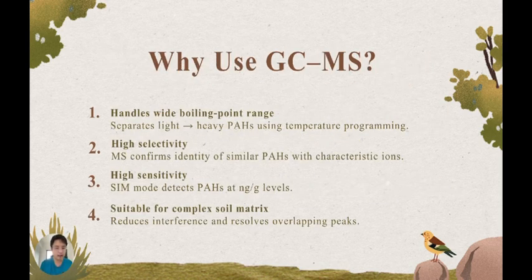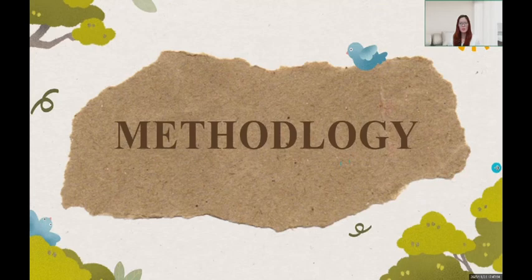The first one is that it handles a wide boiling point range. The second one is the high selectivity. The third one is the high sensitivity. The last one is that it is suitable for complex soil matrices. Let's move to the methodology.